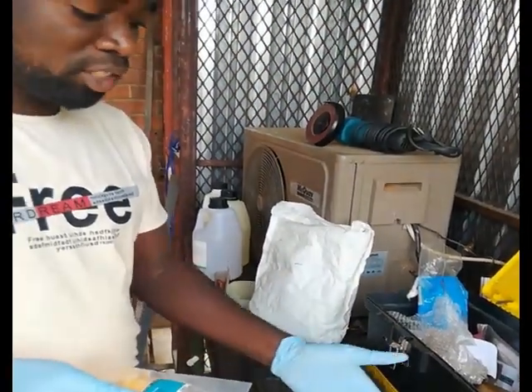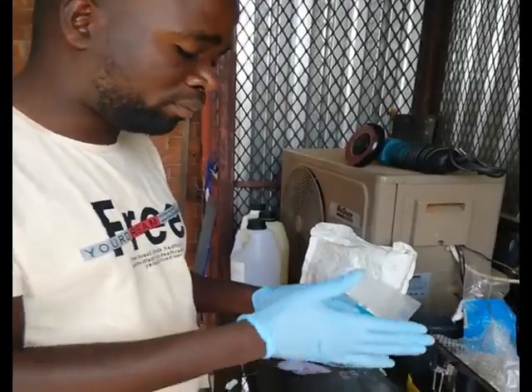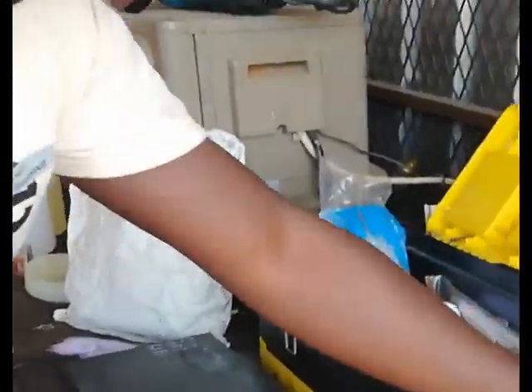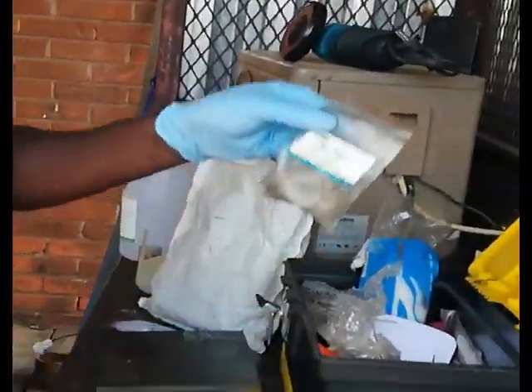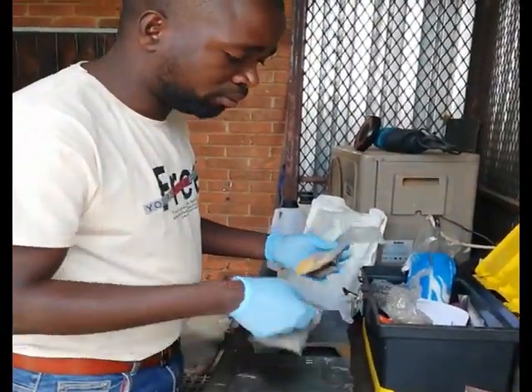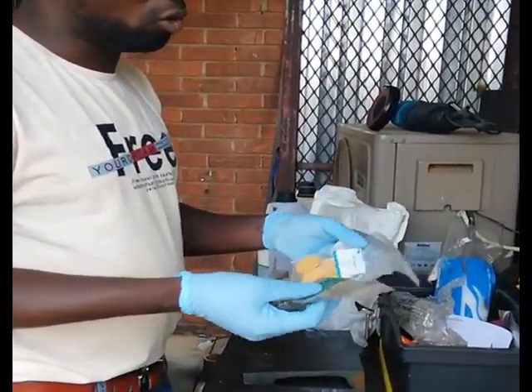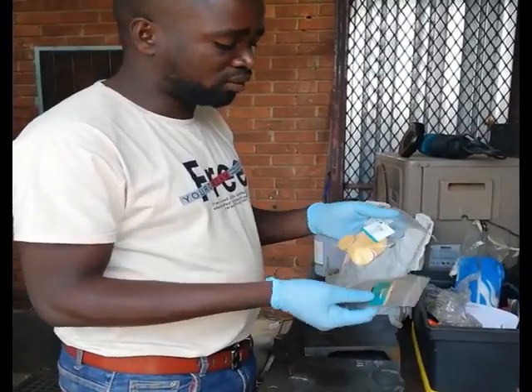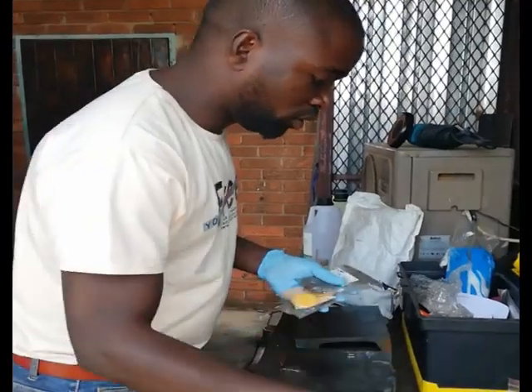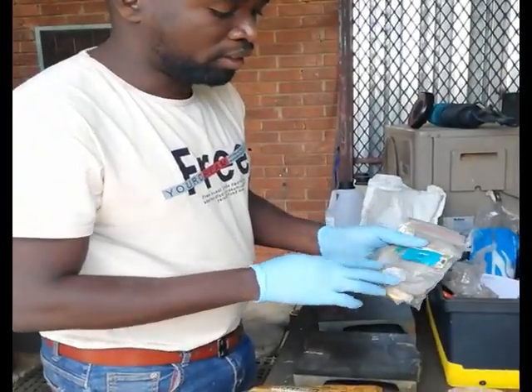With other micro structure techniques, you cut the sample into pieces and then polish it. But with a replica, we polish it as it is. I start polishing using different grits: 320, then depending on how rough the sample is, I go to 400 or 600. For this sample, I start with 320, then go to 600, then 800, and finish with 1200.